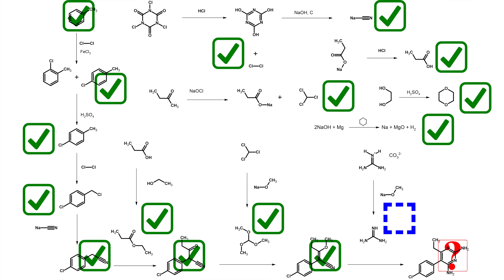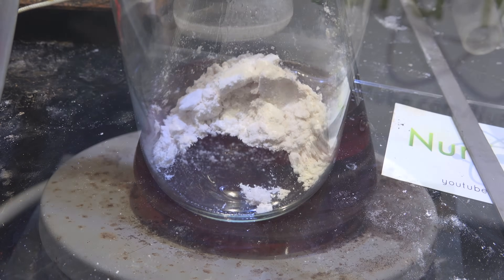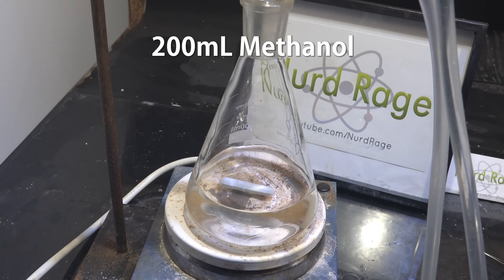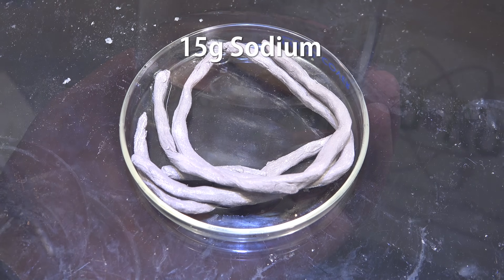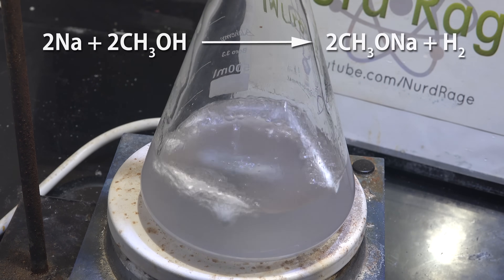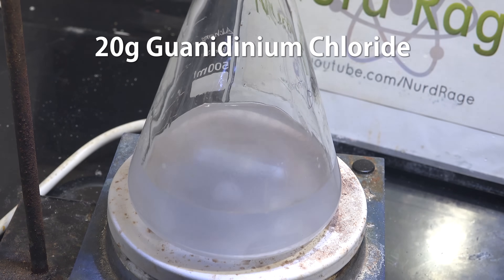At this point we need a source of guanidine. I'll use the guanidinium chloride made in a previous video. We want free-based guanidine, so we have to make it just before use. Swap out the flask and put the reflux condenser on a larger flask containing 200mL of methanol dried with molecular sieves and then distilled. Get 15g of sodium metal made in a previous video, roll it into wires, and add them through the top of the reflux condenser a little at a time, keeping reflux under control. Once it's all added and cooled, take off the reflux condenser and add in 20g of guanidinium chloride.